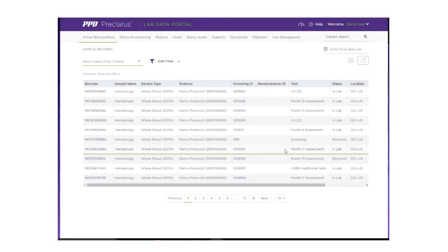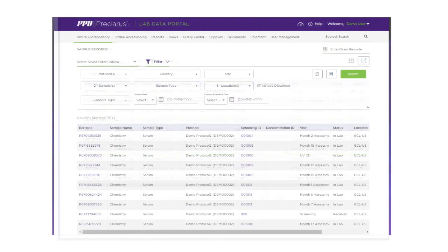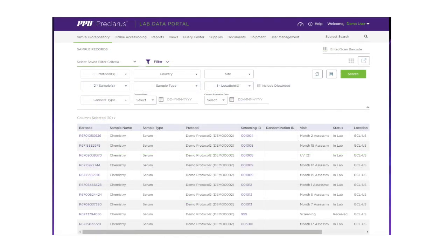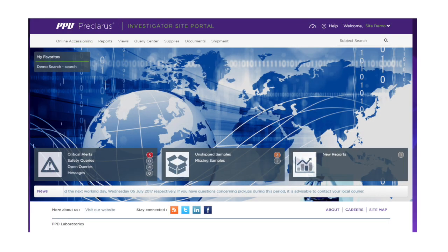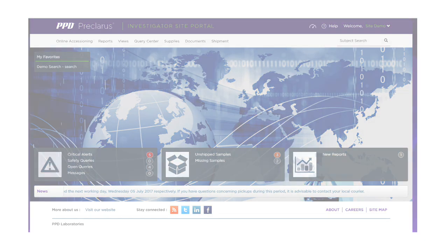Clicking on any graph allows you to delve deeper into the data. The Browse Samples feature enables data filtering in nearly a dozen ways to target the intended specimens, and graphing and visualization tools facilitate greater understanding of results and trends.